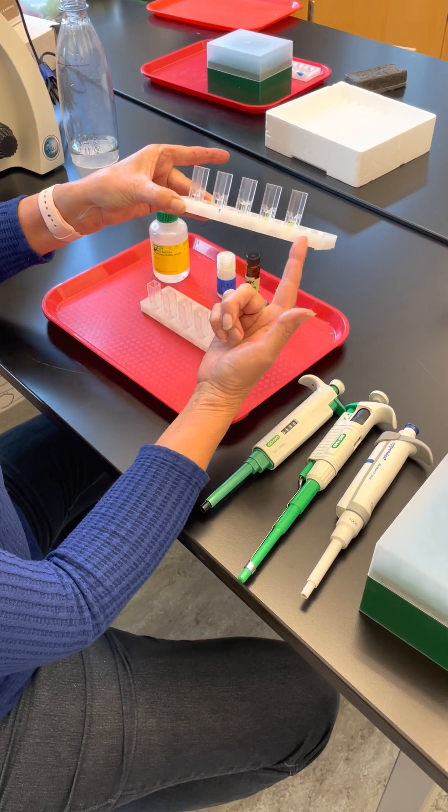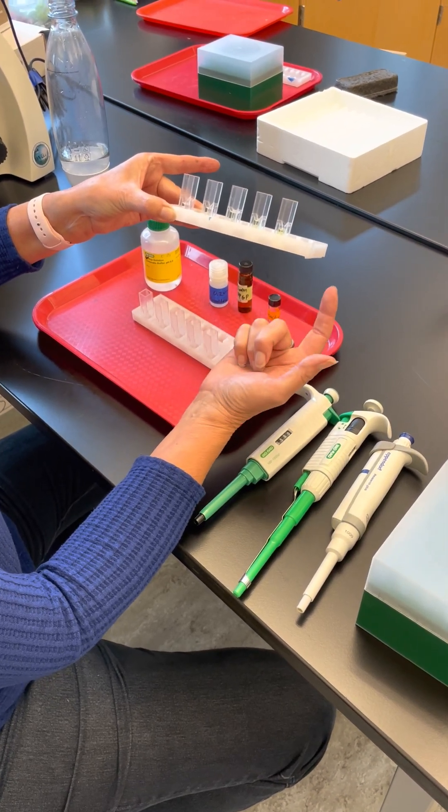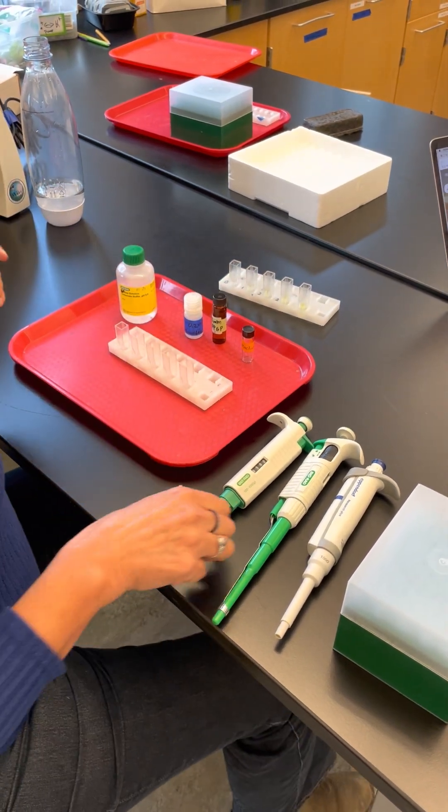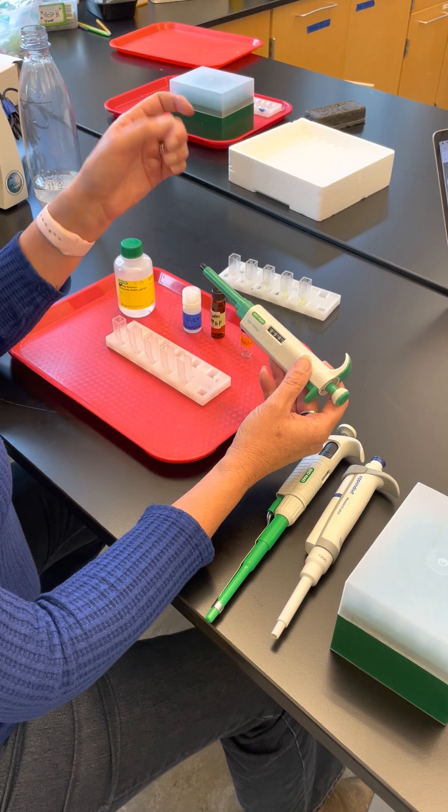As the product is being produced, you're going to see more and more of this yellow color. First of all, you're going to have some practice in using micropipettes.